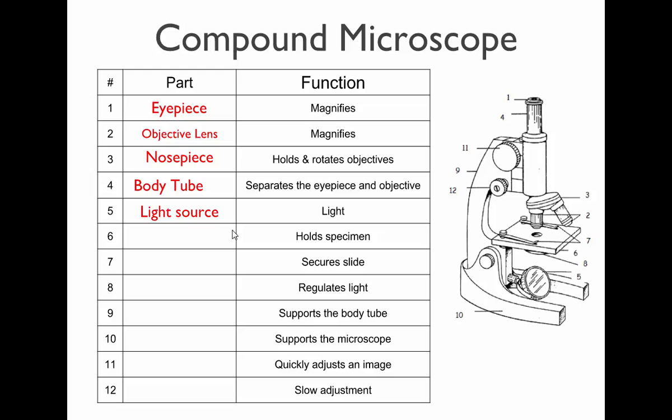This microscope shows an old-style microscope. What is this? It's a mirror. And they used to have a separate light you plug in. You aimed it at the mirror. It reflected light up through the stage. We don't really use those anymore. But couldn't you also make the light more powerful by doing that? You could adjust it, but some microscopes have adjustable powers for the light.